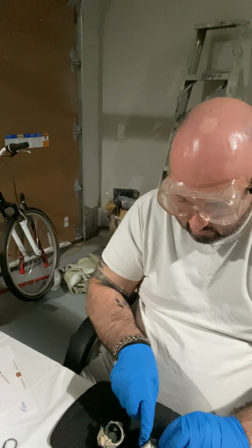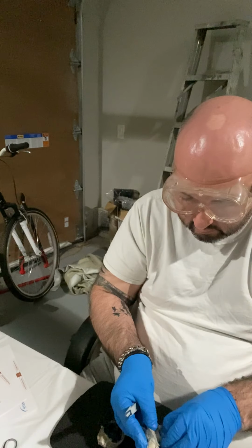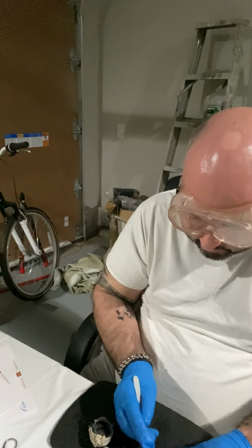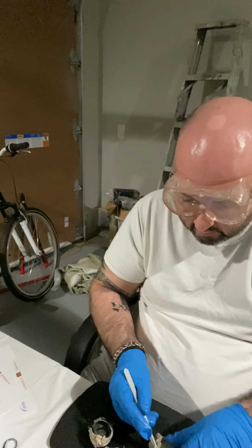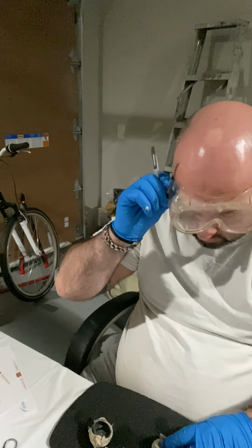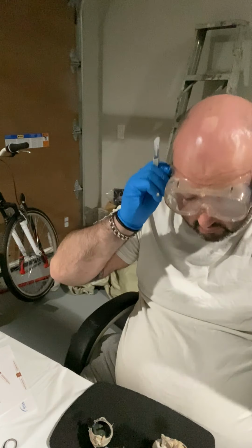And of course, other structures are back here, like the retina and things of that sort. Still no vitreous anything, so we're going to keep cutting further in here. Forgive me, my goggles are fogging up a bit. There we go, that's better.